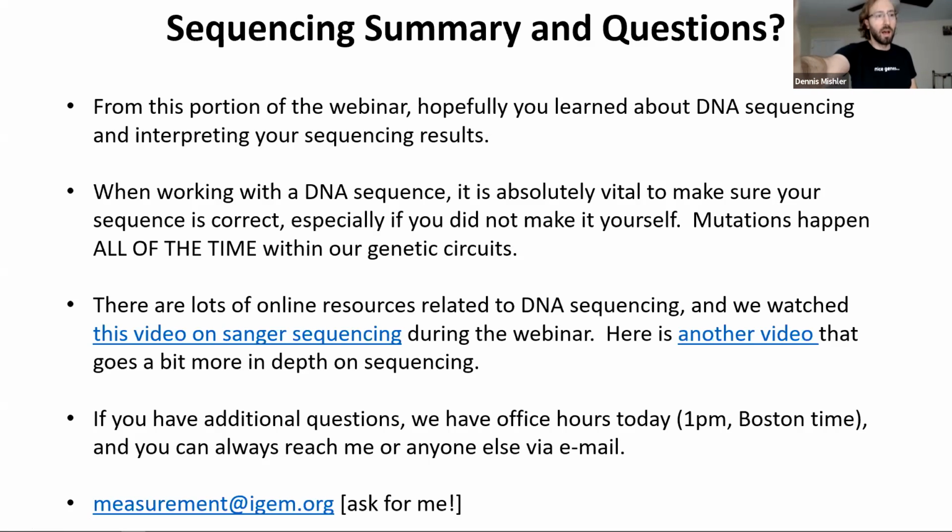So first one, Alexander said he liked the jigsaw example. I do too. I think that's a great 1-minute video. I think it's really clear. If you're new to it, it might have been a little confusing, but if you go back to it once you've seen a little bit more, I think it makes it really clear what's happening. You're getting these 4 different sequencing reads of where the different letters are, and then you're able to combine everything together. I think it's a really nice, quick way to describe it.